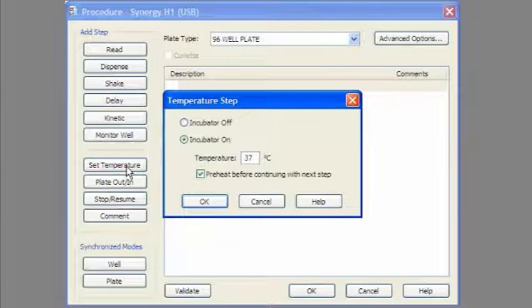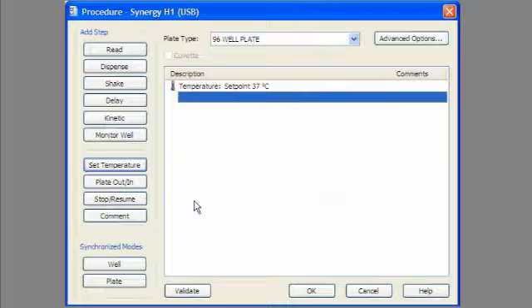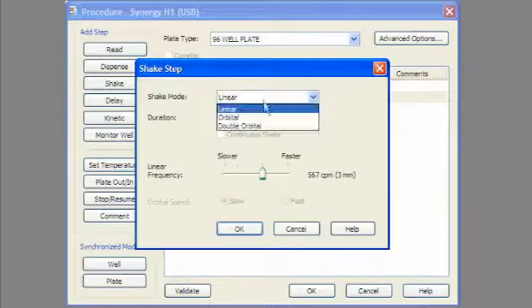Synergy H1 comes with a built-in temperature control system to 45 degrees Celsius, as well as a plate-shaking mechanism.